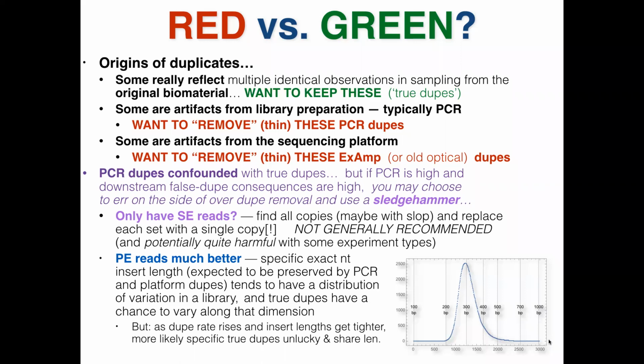But there's a spread, right? It drops off by 200 bases and goes out to 600. There's some asymmetry on that distribution, but all these lengths are represented. It's not a flat, uniform distribution, but a lot of it would be between, say, 250 and 350, which is still a 100 nucleotide range of appreciable variation.